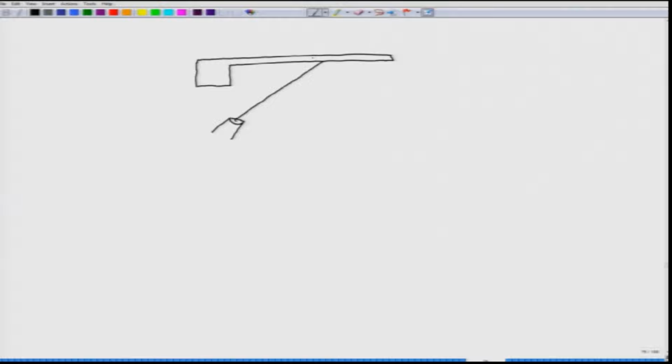Oh, by the way, this is our week 8 lecture 3, W8L3. You shine a laser on this cantilever, and this laser will bounce back like this. So, this is how you are shining, it hits that silicon cantilever and it bounces back.